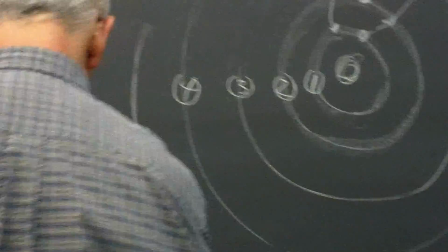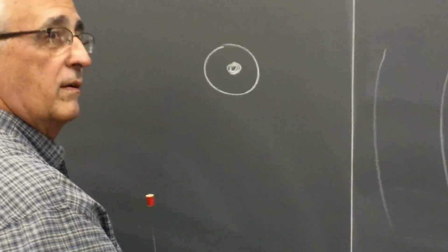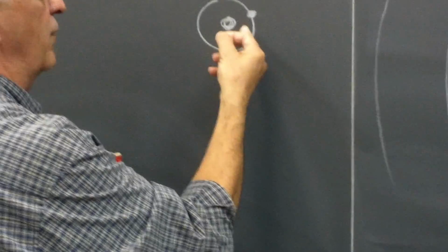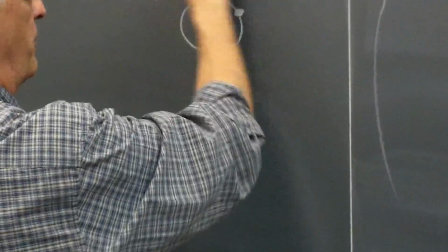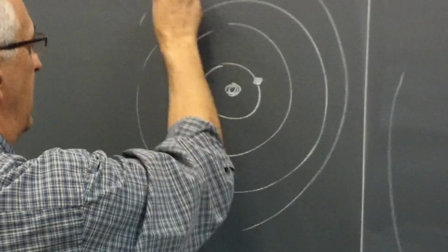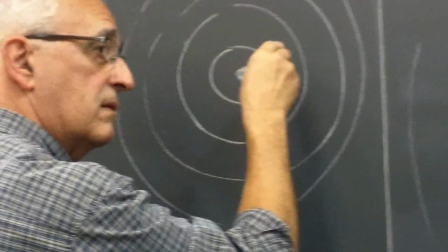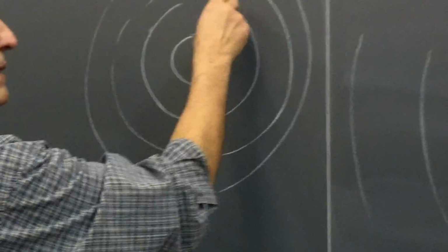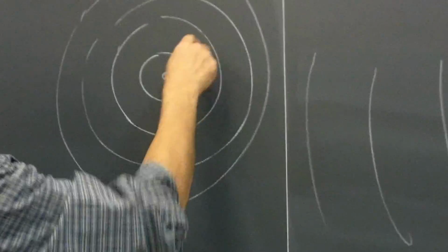Now, in the case of hydrogen, hydrogen is one proton and one shell with one electron. Well, that one electron actually jumps up. Where does it jump up to? It jumps up to these unoccupied shells. They have no electrons in them, but they exist. Whether you know it or not, they exist. That will jump up and find the shell and reside there for an instant and then come back down again. So hydrogen and helium, we're going to look at those two today using the electricity as a source.